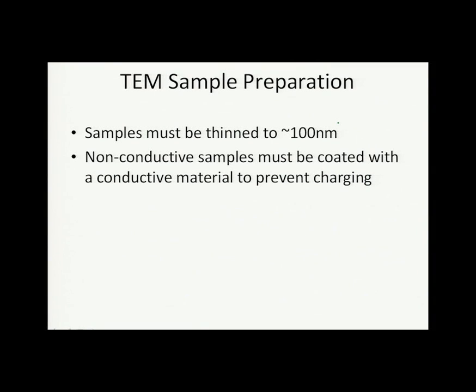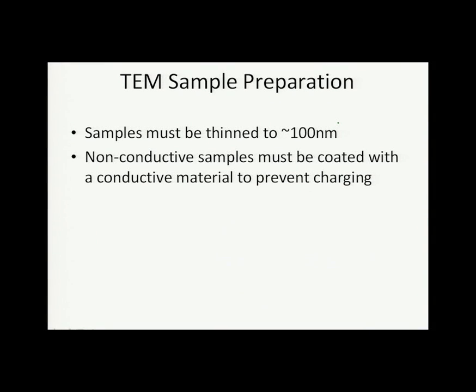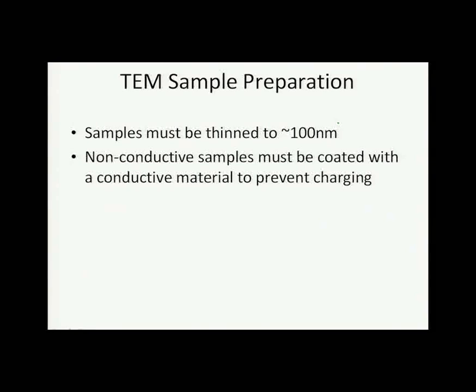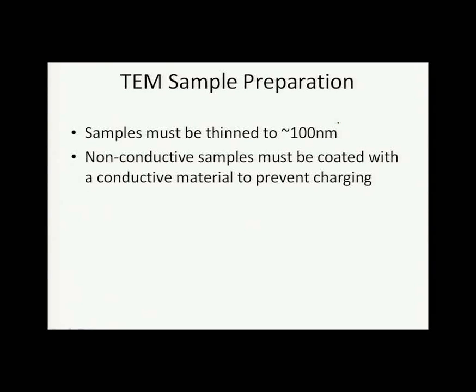And what I should have stated earlier was that for scanning electron microscopy and field emission scanning electron microscopy, it's also important that your sample be quite conductive. And if it's not, for FESEM or SEM, a typical remedy is, again, to coat your sample with a thin film of conductive material such as gold or some other noble metal, and we only need a few nanometers.